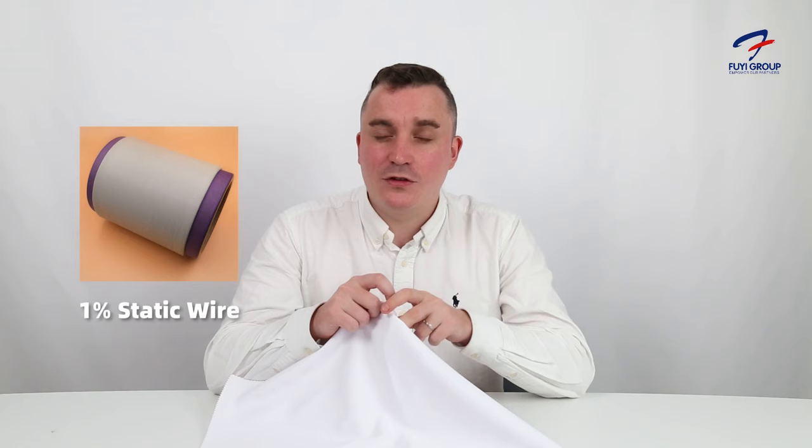The interior of the fabric is very breathable. We also have a 1% static wire as part of this fabric, which means it's a lot better in terms of anti-static. This anti-static wire can go through 50 washes without any issues — that's another big benefit of the fabric.